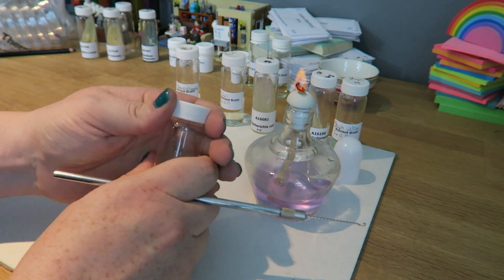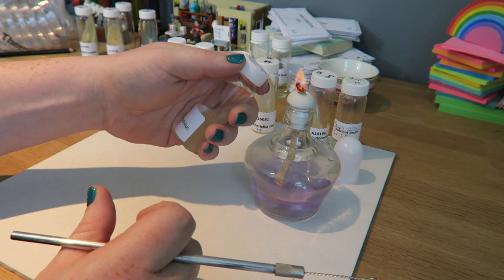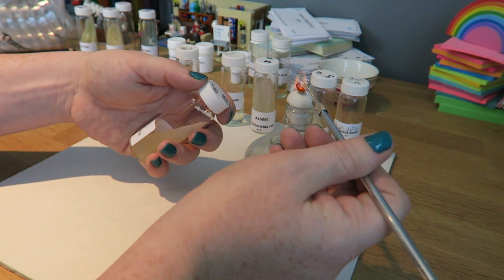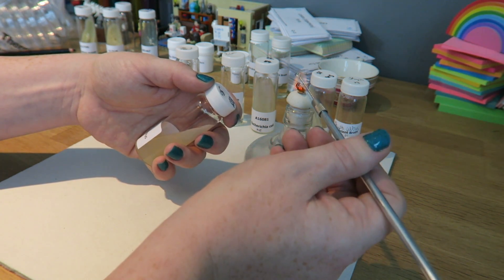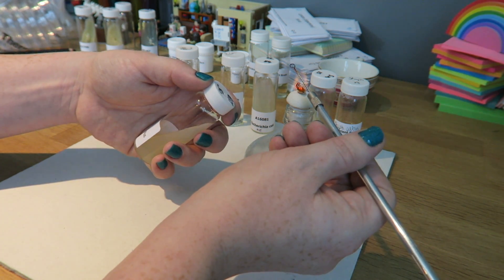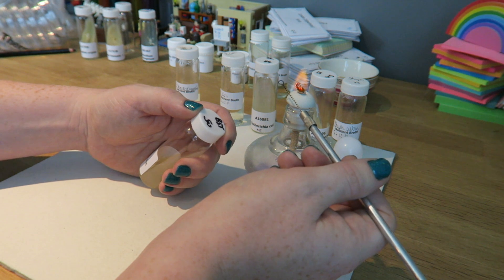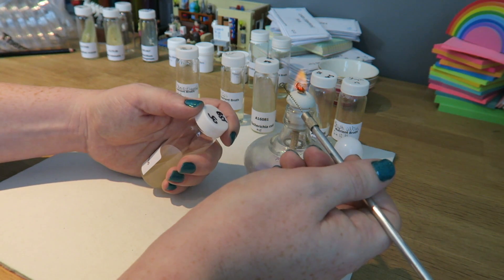Here I have my spirit burner. With your left hand you're going to need to open the lid, keeping it as close to the flame as possible. This one has agar in it so I'm holding it slanted so I can get my inoculation loop into it. I'm going to heat my inoculation loop until it is hot — you can see it's starting to glow red. I'm going to do that all the way down. Then I'll wait for it to cool, but leave it next to the flame so that any bacteria in the air doesn't get onto the loop. I don't want to use it when it's too hot, otherwise it's going to kill the microorganism I'm culturing.